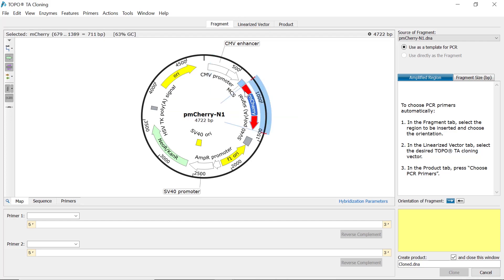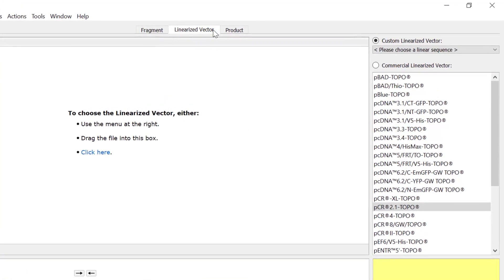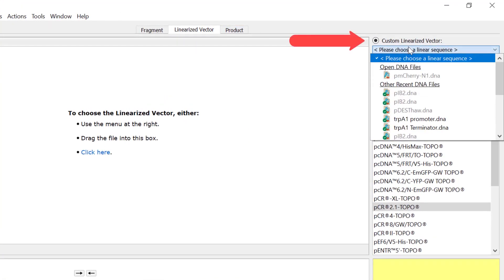The second step is choosing a vector. Switch to the linearized vector tab to specify your vector. You can either select a custom file you have saved on your computer, or choose from the list of commercially available files within Snapgene.